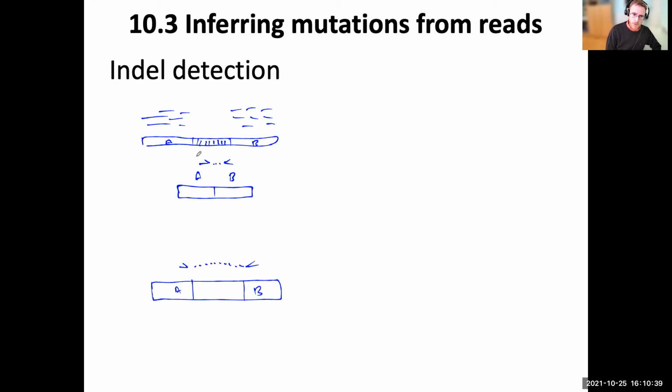And if we repeat that, if we have many reads that span A into B, what we'll find is there's a bunch of reads with very long insert sizes that span this region. So there'll be some reads that are inside A that have small insert sizes, where the distance will be normal, but the read spanning this junction will be very, very large. That would suggest there's an insertion in the reference compared to the sample.